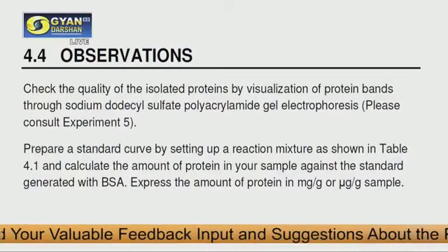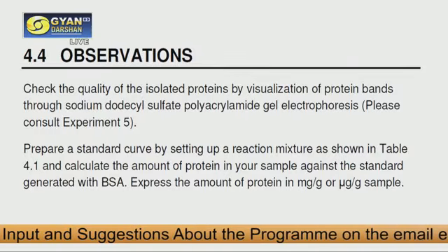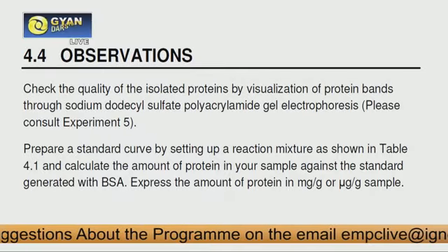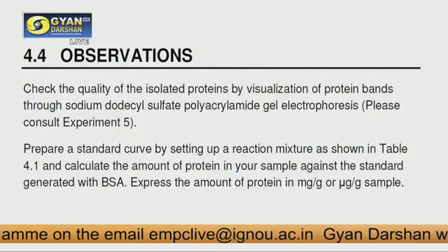So you have to check the quality of the isolated protein by visualization of protein bands through sodium dodecyl sulfate polyacrylamide gel electrophoresis, which will be our next experiment and the last experiment for today.